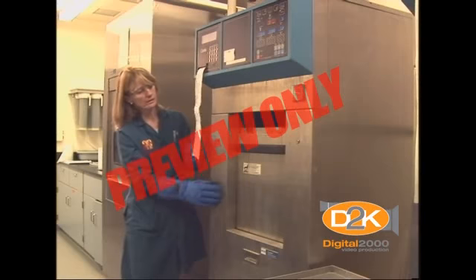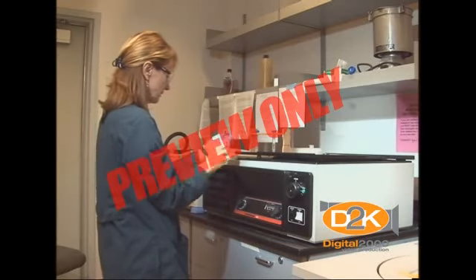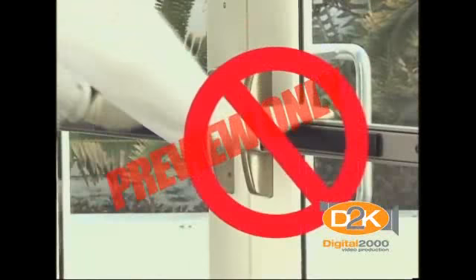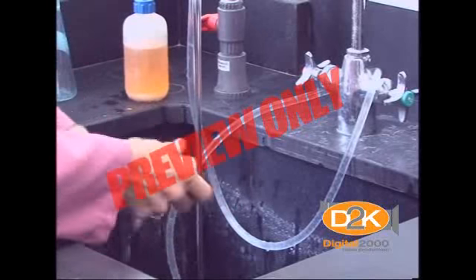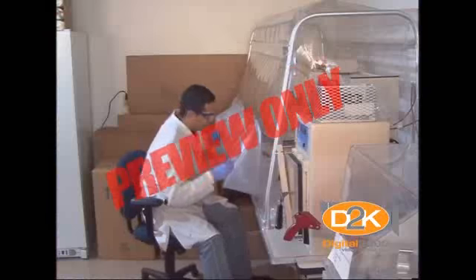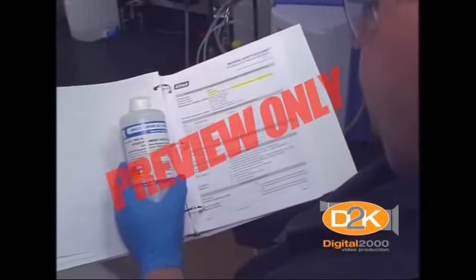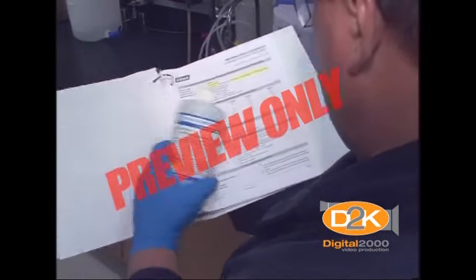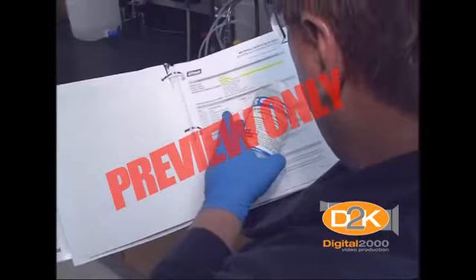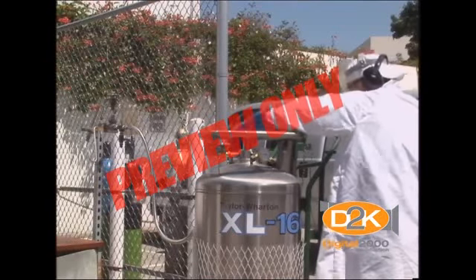You should know your glove type. Is it appropriate for the job? Gloves should be changed often. Remember to remove your gloves before leaving the laboratory to prevent contaminating other things. Always wash your hands after using gloves. Double gloving is helpful when you change gloves a lot. Remember, before using any glove, read the Material Safety Data Sheet, or MSDS, for the materials that you will be working with, and, when in doubt, check with the glove manufacturer for specific use.